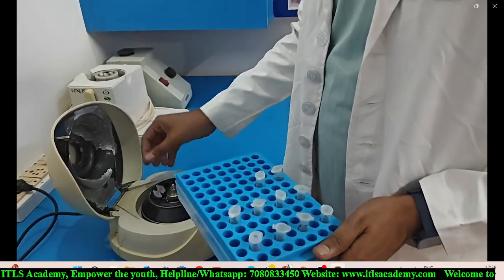Now you need to keep all these into the centrifuge. You need to make sure that you put these Eppendorf tubes in balance.